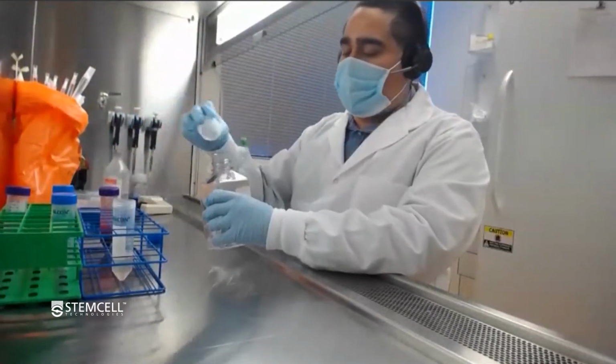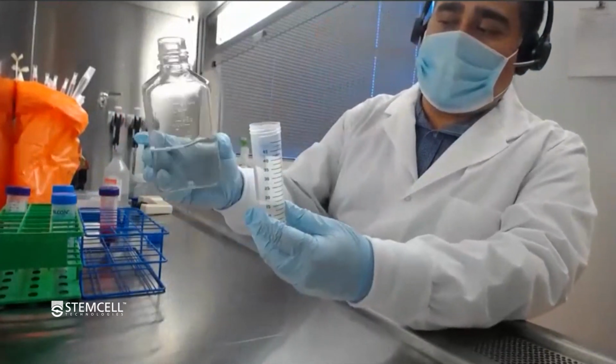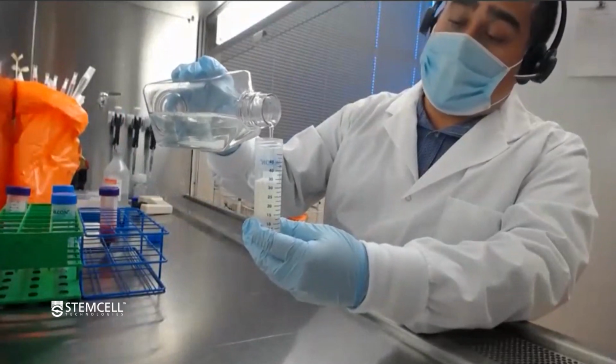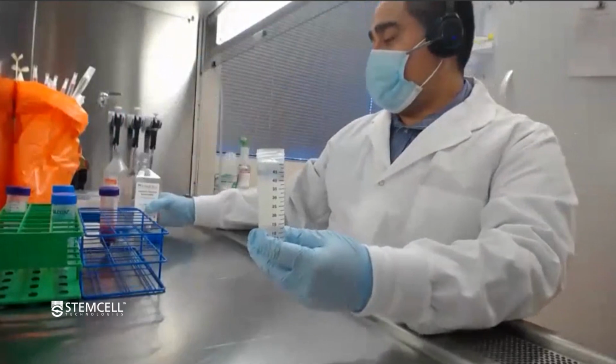After you've poured out your desired PBMCs, then you're going to top up with PBS and 2% FBS to wash. The reason why you want to do a wash is that over time, density media can be a little bit toxic to the cells. So you really want to get that out of there.